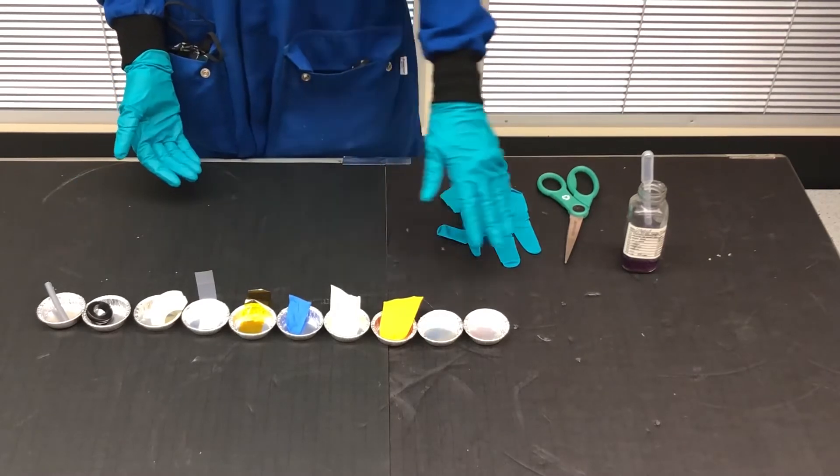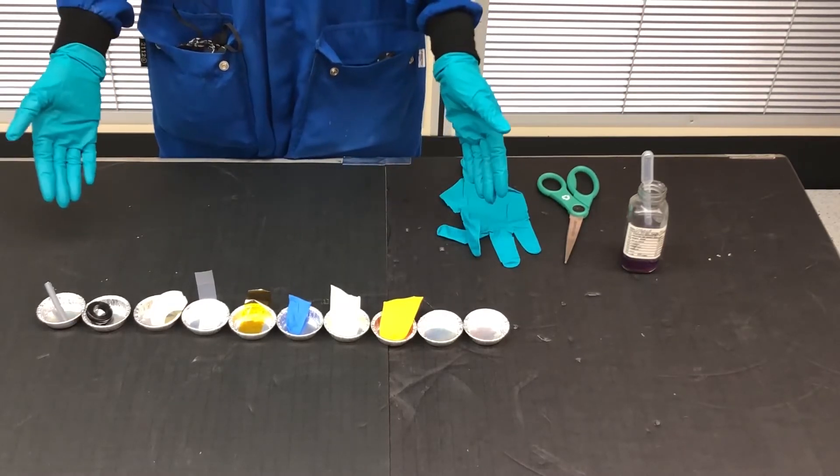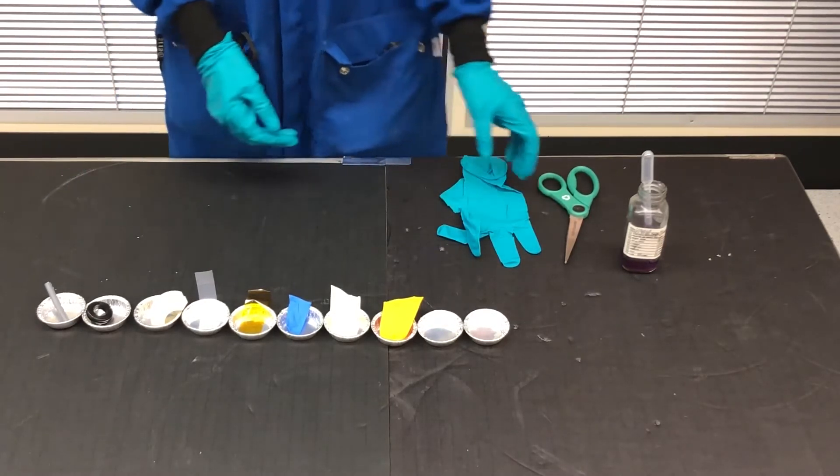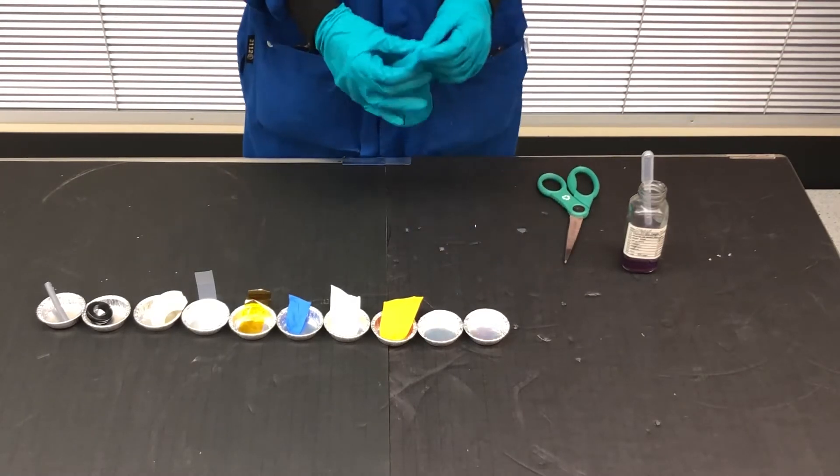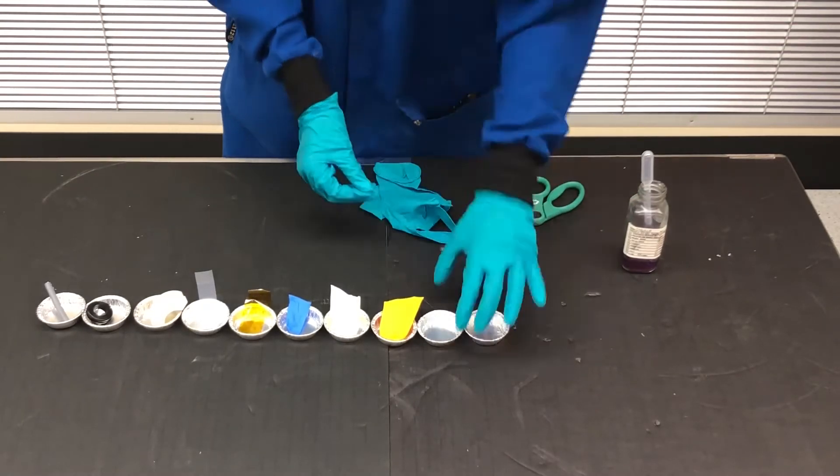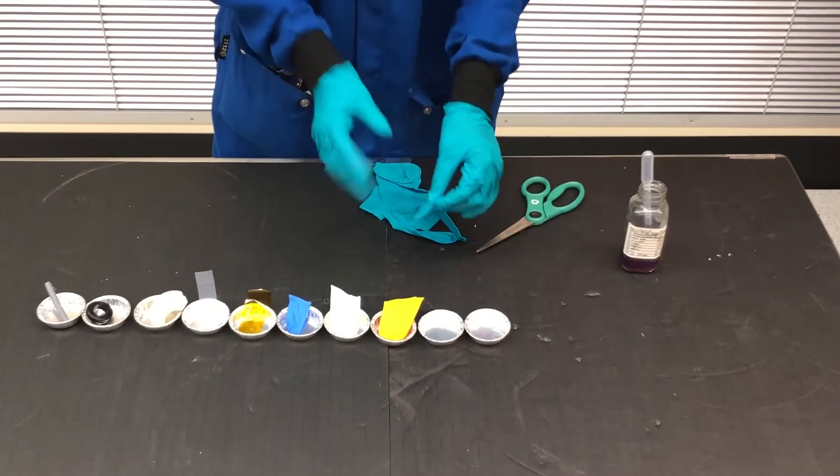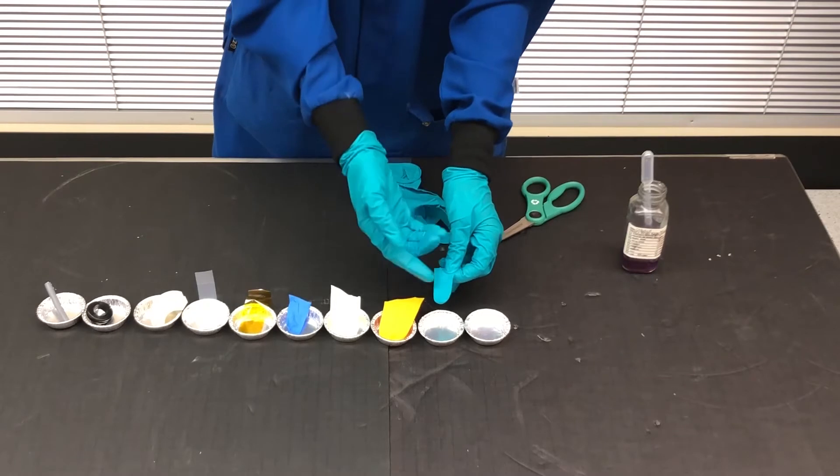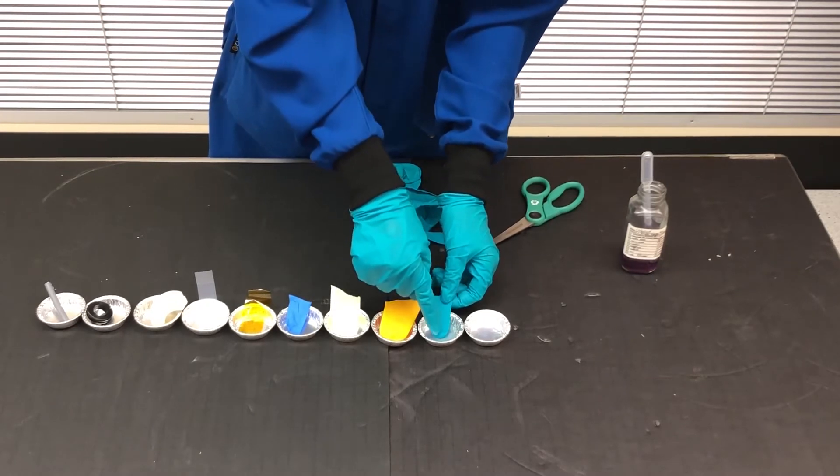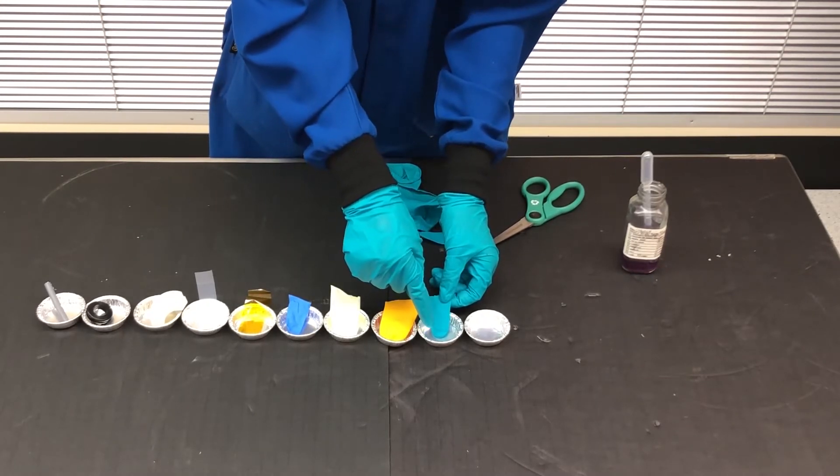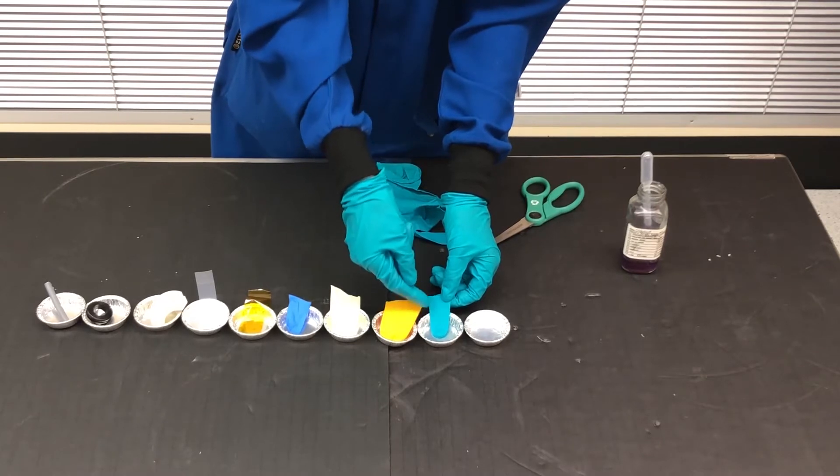Once all the potential sources of contamination are found, prep your sample for testing by using scissors and cut off a small portion. Then place the small sample of material into a small metal dish as it does not have to use much material. Place the small sample so that it's touching the bottom of the tin, but that there is a portion that is still overhanging and exposed.